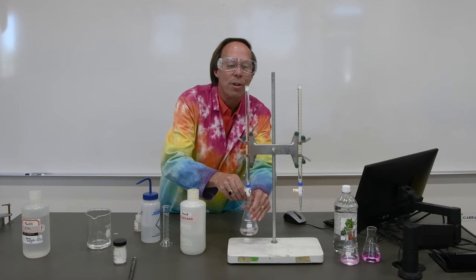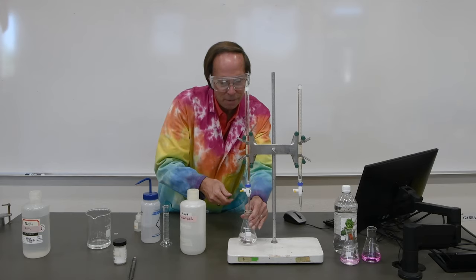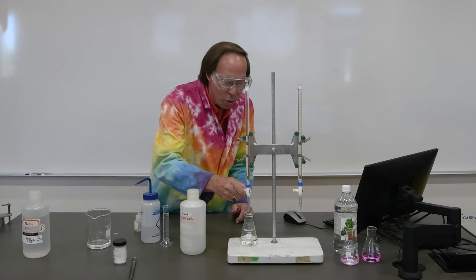There's 4, 5, 6. Now I'm starting to see a little bit of pink appearing. We're at 8 as it gets closer. 9, 10. That's about 11.5 right there. So we should be within a milliliter or so. So let's go ahead and see if we can sneak up on this. We'll start adding it again, one drop at a time.